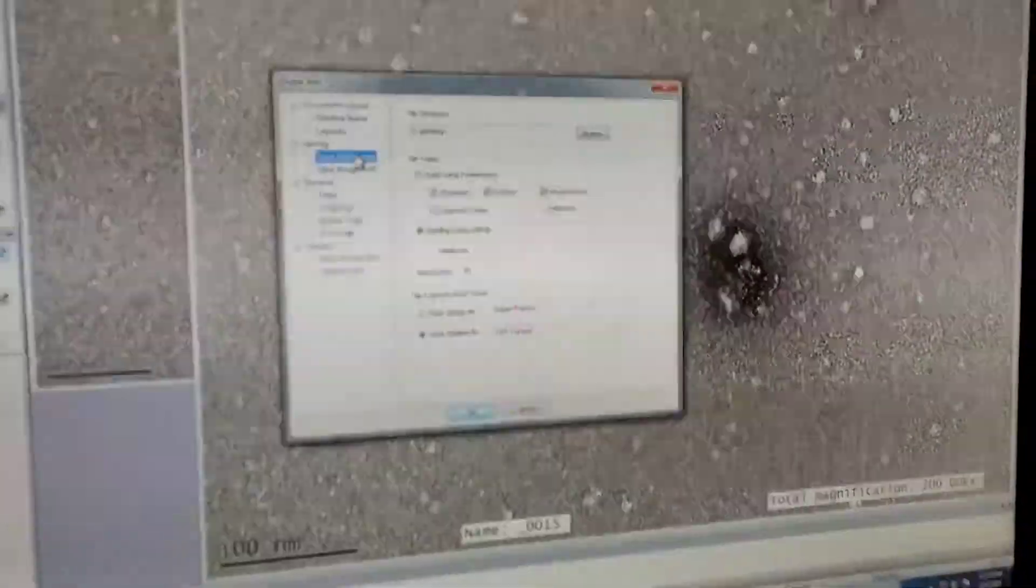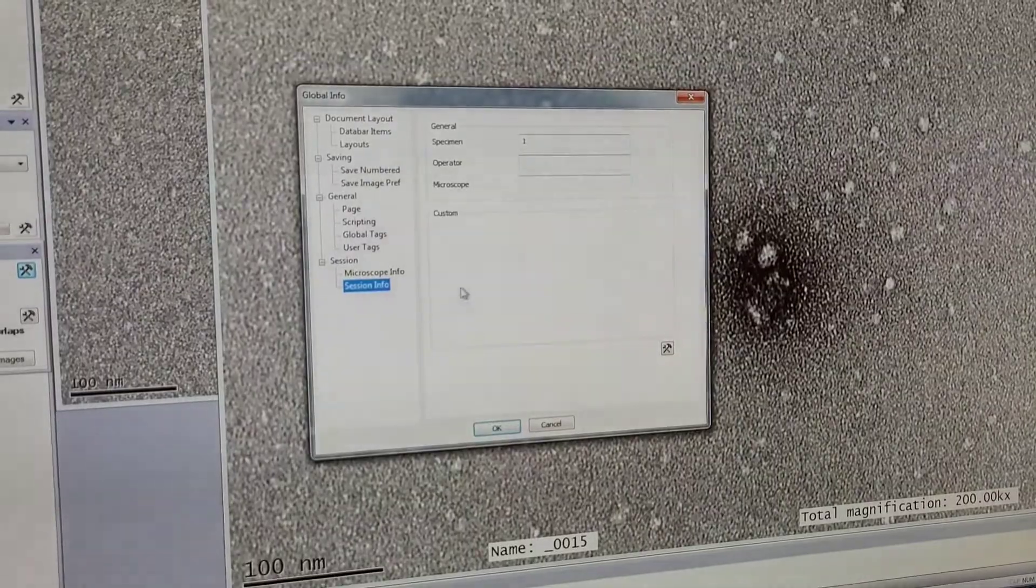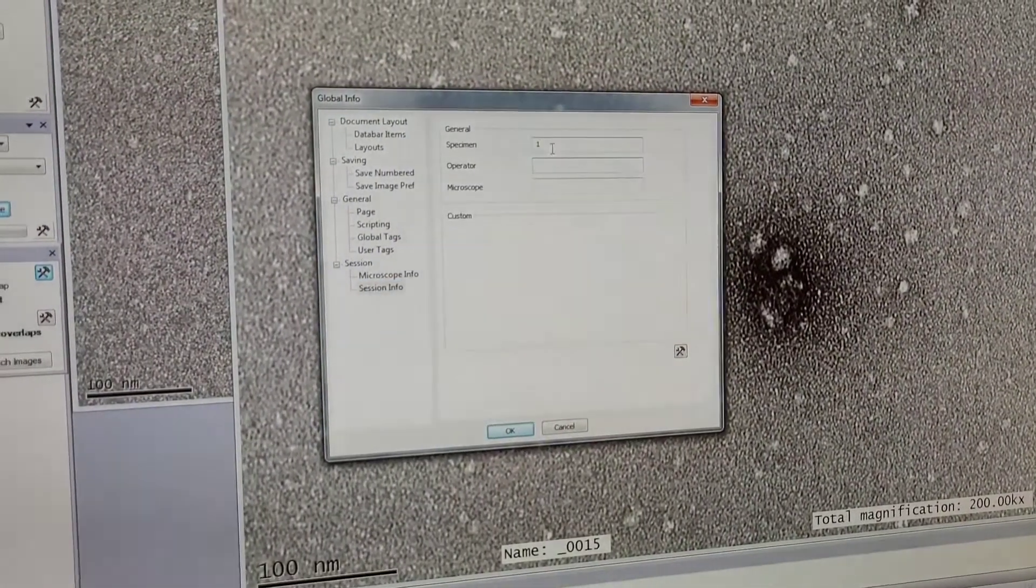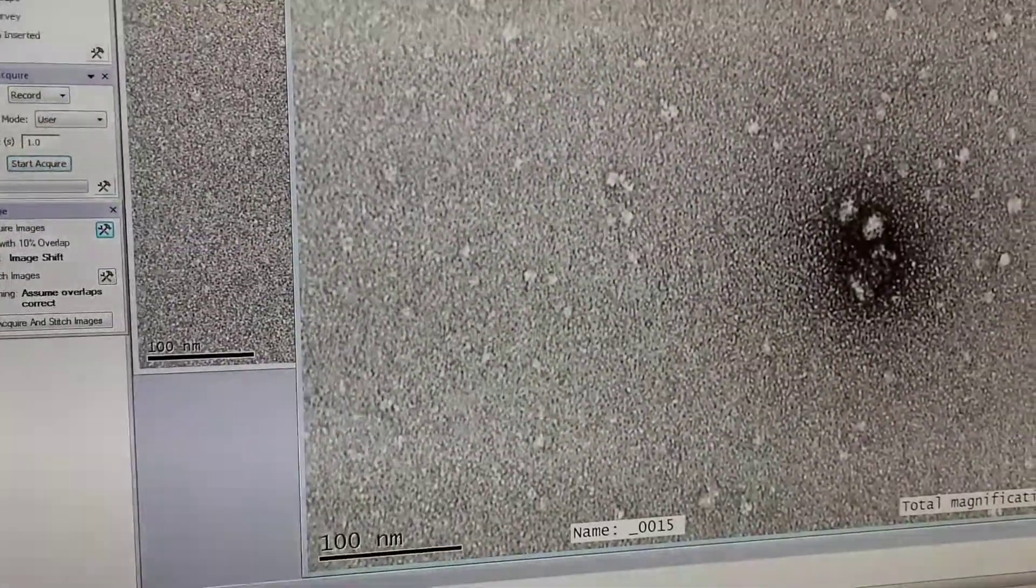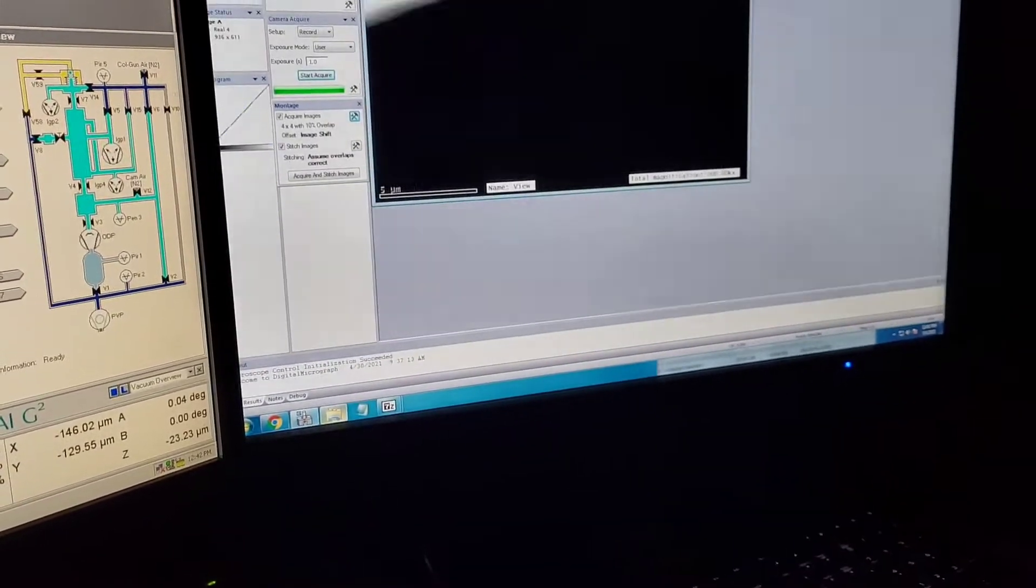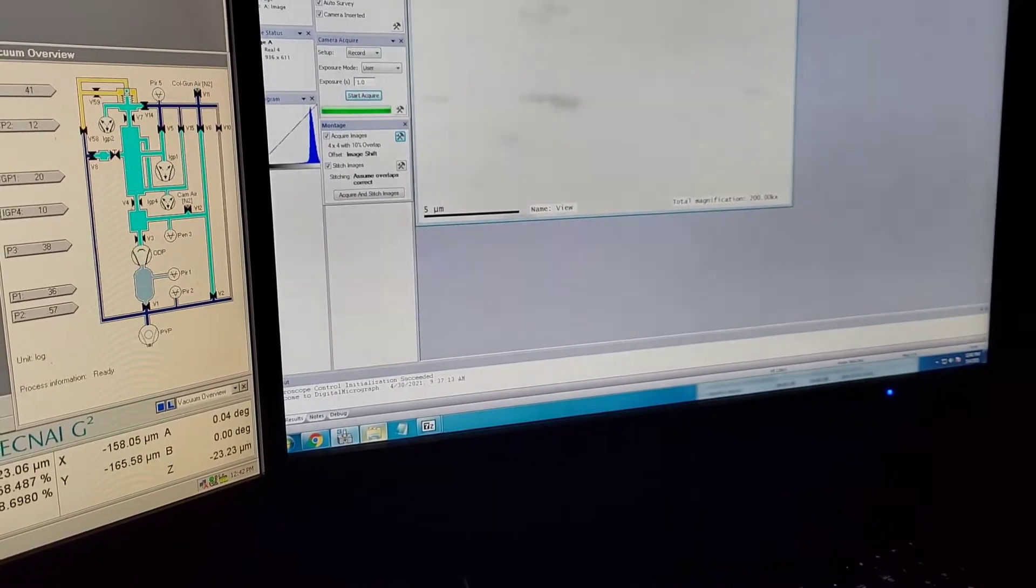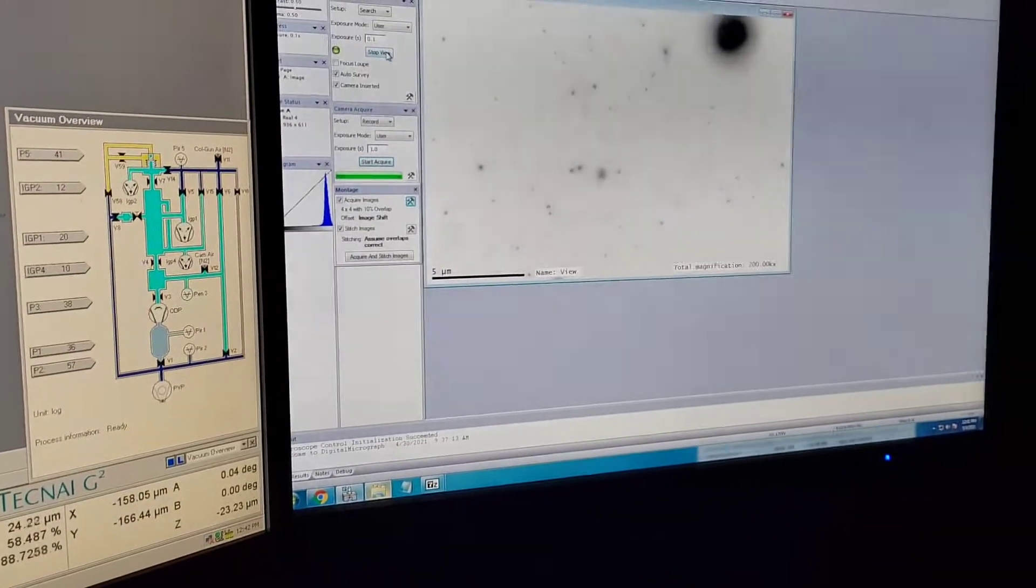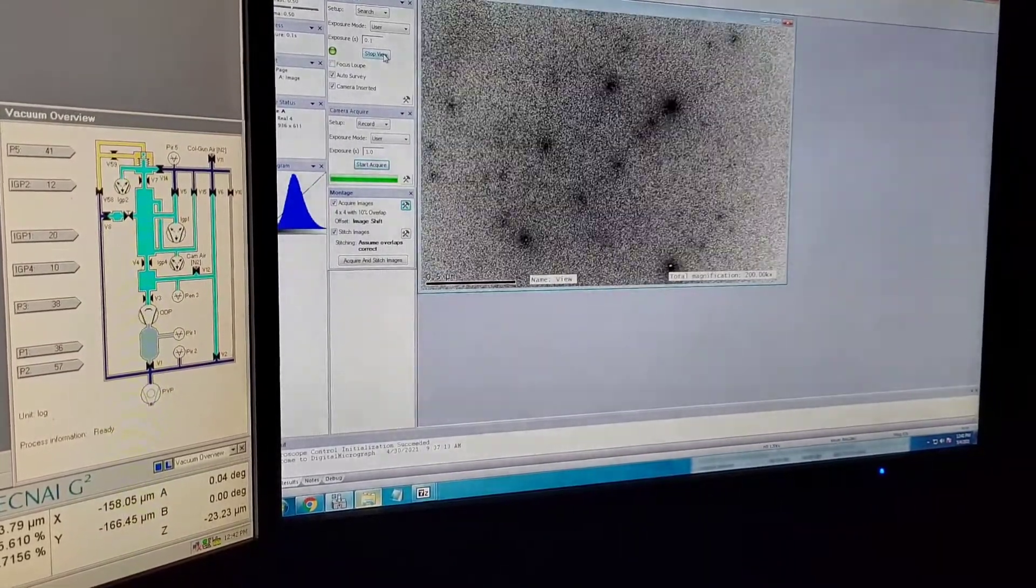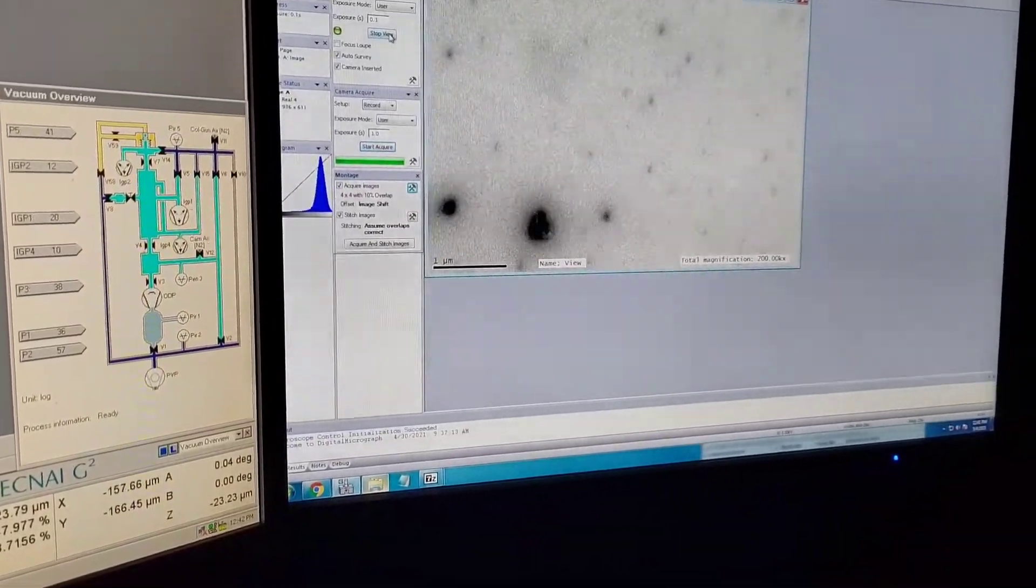Then you want to make sure that your files are going to be saved in the proper folder and choose an appropriate specimen name. These are basically just easy things to do. Then you can start the interesting part where you search for good positions to take images and focus on taking beautiful images with the right focus.